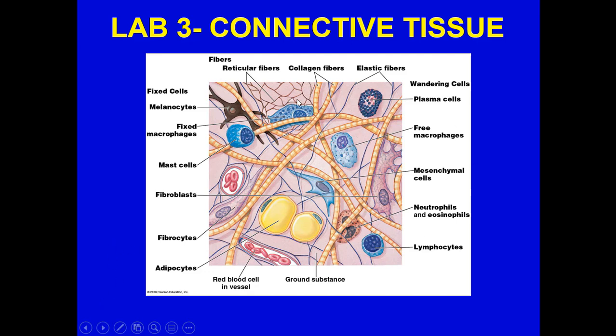This is sort of a generic example of a connective tissue. So what are you going to find? You're going to find elastic fibers, collagen fibers, those big thick fibers compared to the small wimpy looking little elastic fibers, but they all play an important role. You will also find capillaries coming through here with red blood cells that supply nutrients. You will also find the possibility of adipocytes.